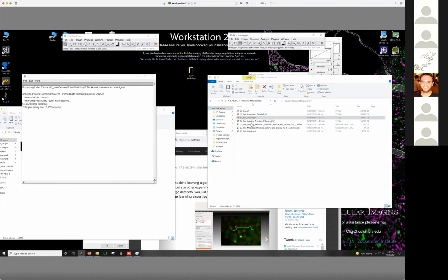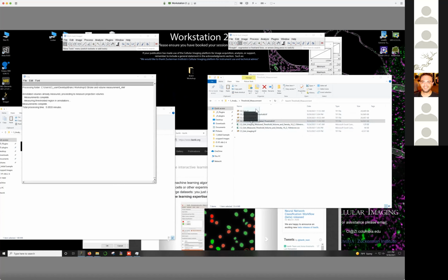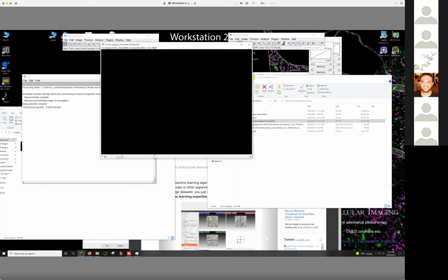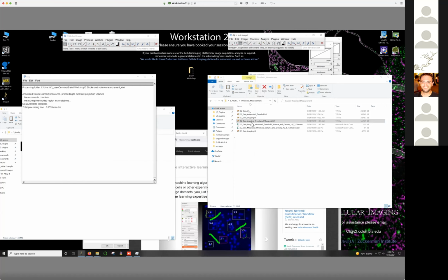And then we can run the analysis as I showed you. We'll get the same images that have been thresholded, so you'll have an image that shows you what brain regions you were imaging in. This was actually analyzed in the Kim atlas. So these are the different regions in the striatum where the lens was placed. And then you'll get a measurement here.